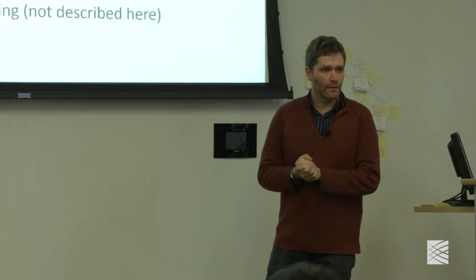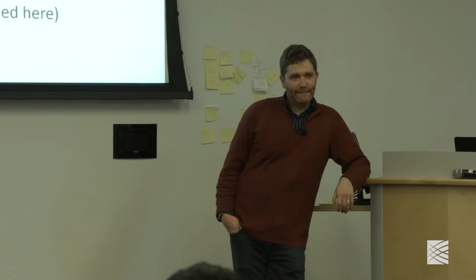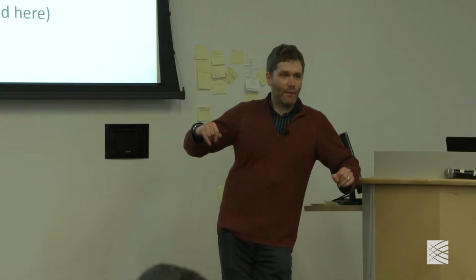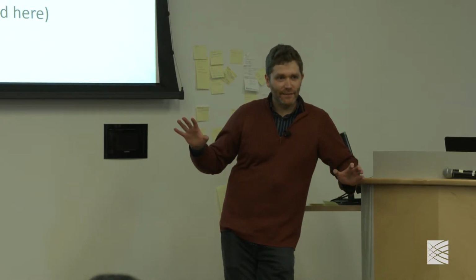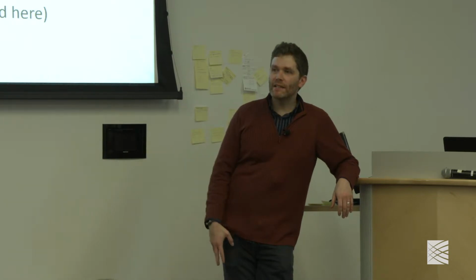What about a situation where, for example, you don't have a sample run on the same machine? Is it better to keep an external PON, or go without a PON? The one thing we like to throw out is that we use a PON, but actually one of the things we'd like to be developing is a way to go PON-less, because both the copy number and small mutation tools use PONs, and logistically they're actually difficult and annoying.